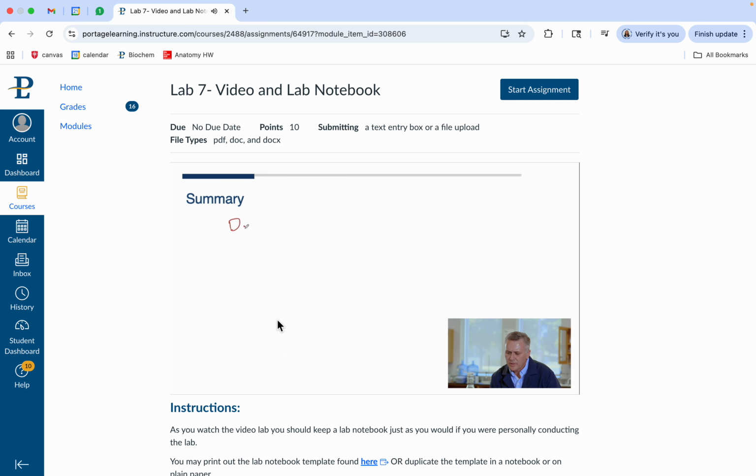All right, so we finished up with dialysis. We were able to take the dialysis. Then we did some CM gel chromatography, and that was a big part of what we did. And then we analyzed the overall part of this by SDS page, and we brought all those together to make a purification table. Right, and that purification table is just a nice, tidy way to bring together all of our results that we've done in Experiment 6 and Experiment 7.